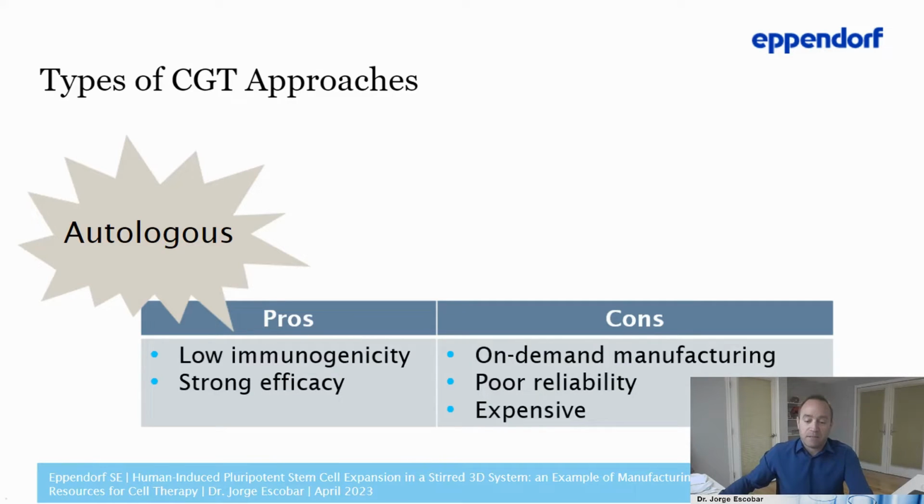Regarding that, this challenge raises questions about whether an alternative approach can be considered, taking into consideration all this knowledge accumulated with the current autologous strategy, and offer a simpler solution to develop a cell therapy product for many patients.